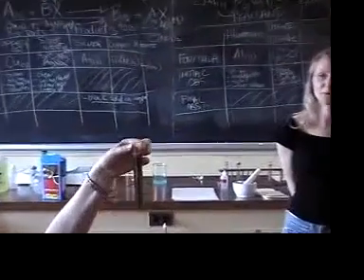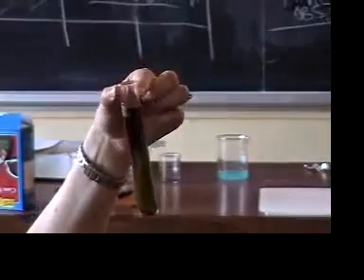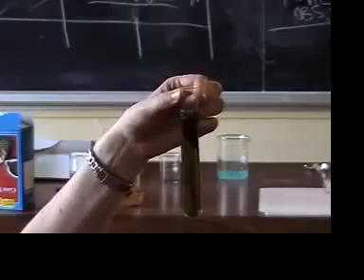It just so happens that I actually purified some chlorophyll. This is chlorophyll in ethanol. I'm going to bring it around, and you can take a look at it and make some observations. What do you observe, Lori? It's liquid, and it's sort of clear, but it's definitely green with a little bit of yellow, but mostly green. A green solution. Okay, that leads us to a question.